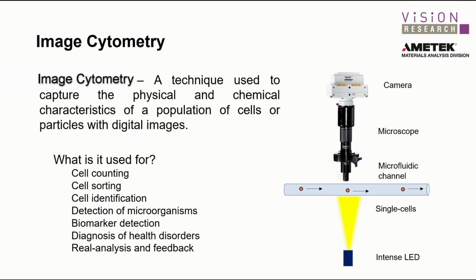And this technique is also used for cell counting, sorting, identification, detecting microorganisms, looking for biomarkers, it could be used for diagnosis of health disorders, and real-time analysis and feedback.